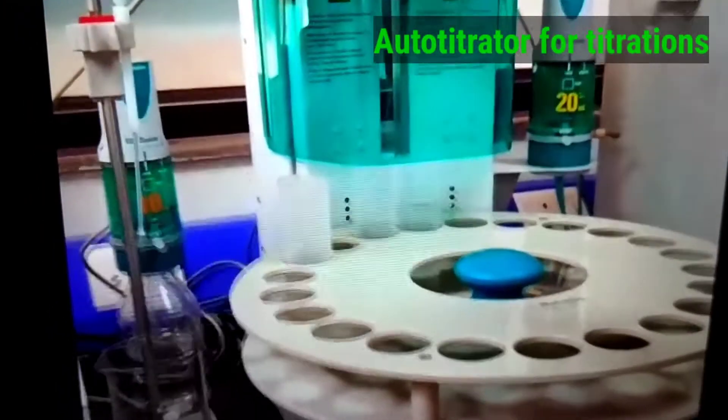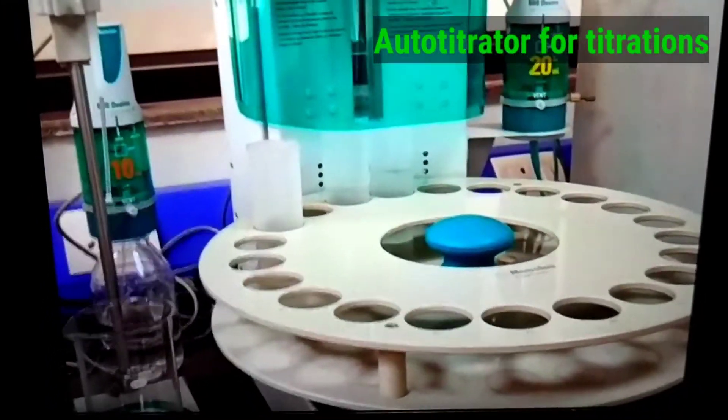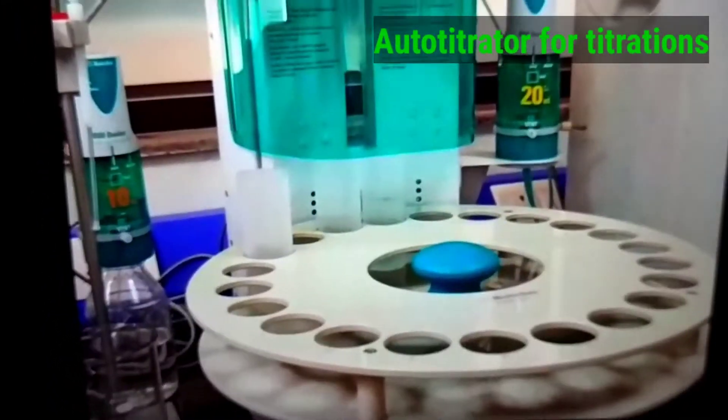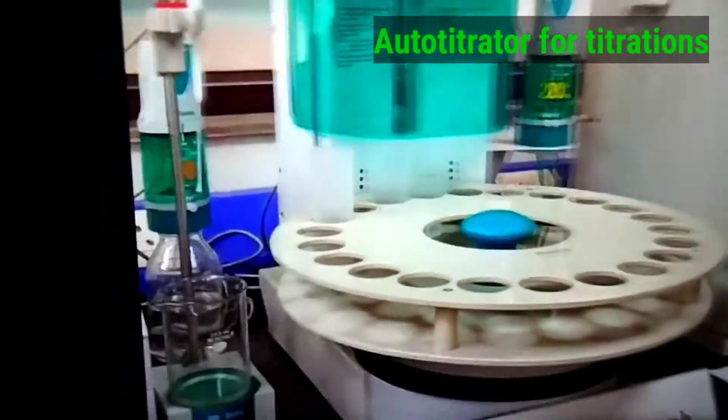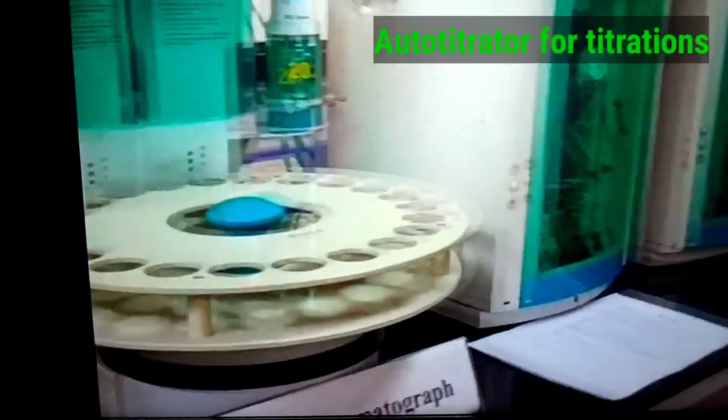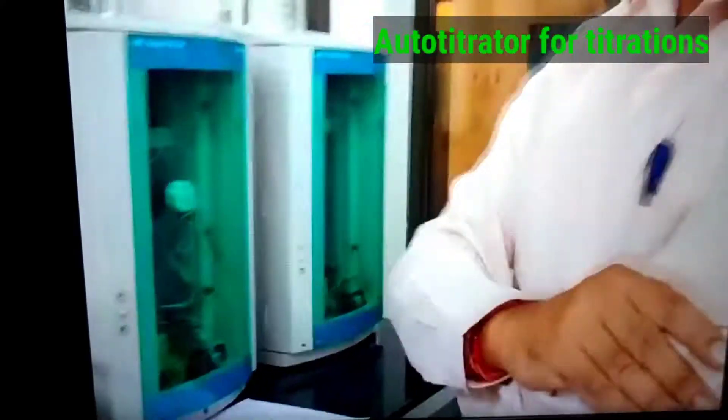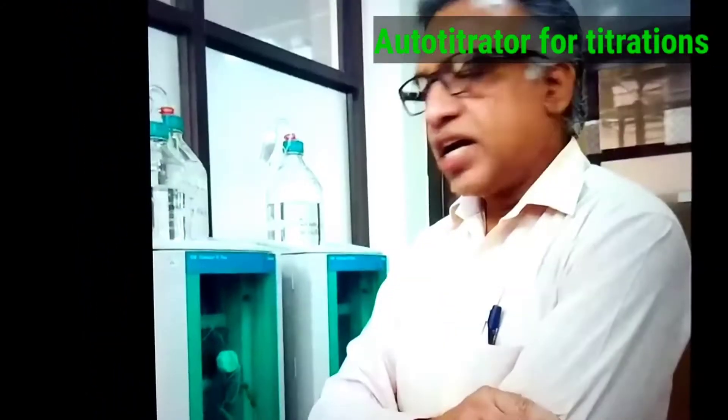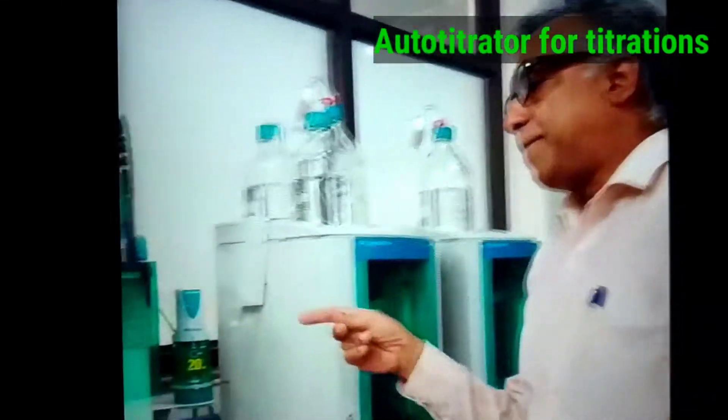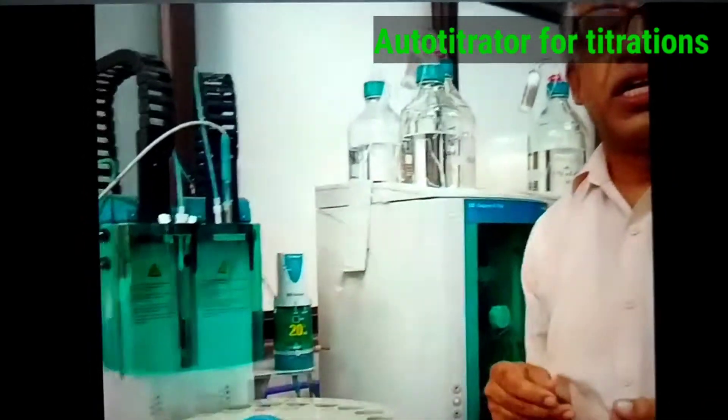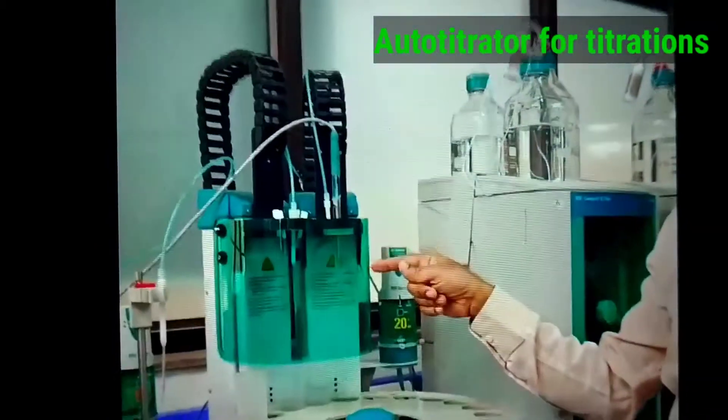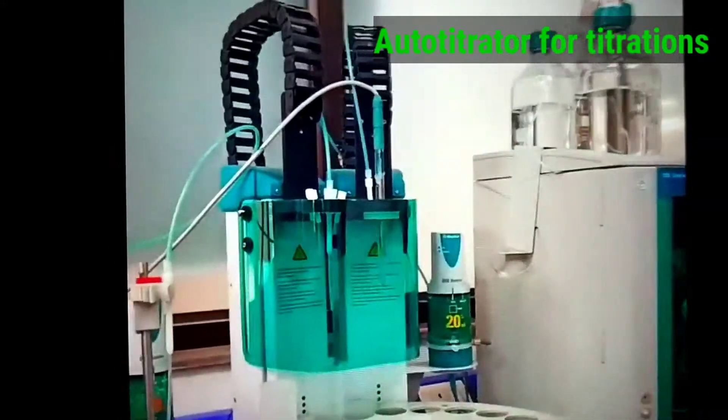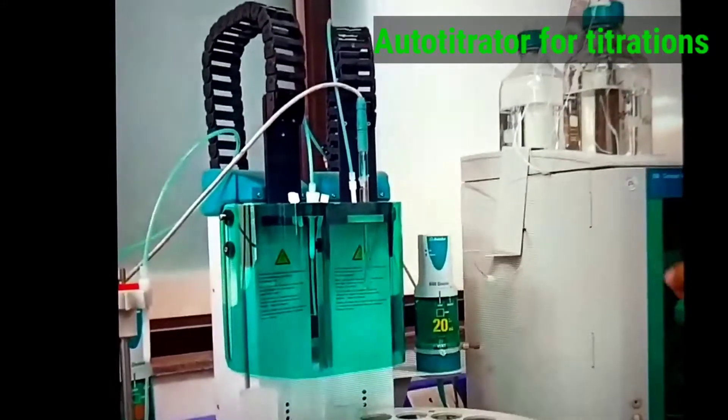You know, for P alkalinity as well as M alkalinity, if you are using pH, you are calculating alkalinity. There are two endpoints for pH: one is 4.2, the other is 8.3. So if your sample has pH, say suppose, more than 8 like 9 point something, it will add this acid. When the pH comes down like 8.2, it will count how much amount of acid has been added to your sample.